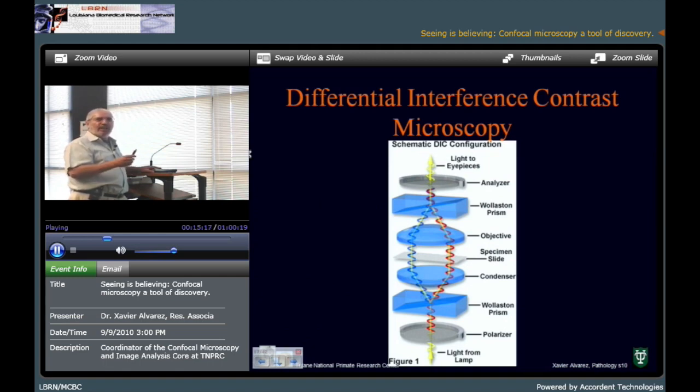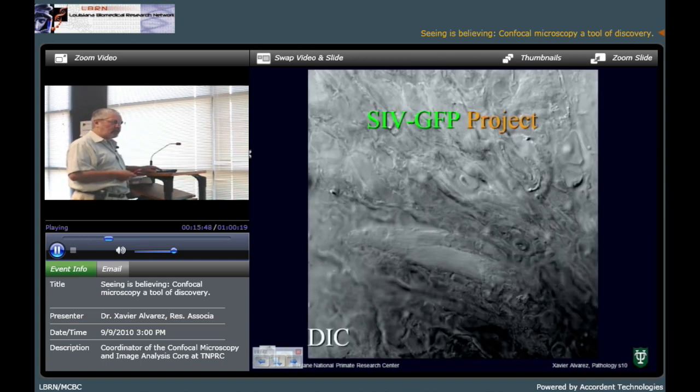The polarization of the light is just that if the light is vibrating in many ways, the polarizers allow the passage of the light that is vibrating only in one direction. If we put two polarizers in opposite directions, perpendicular, after the two, you have no light coming through. Then anything that you put in between will interfere with the pattern, and that's what you see. When you have them in your hands, oh, it's true.